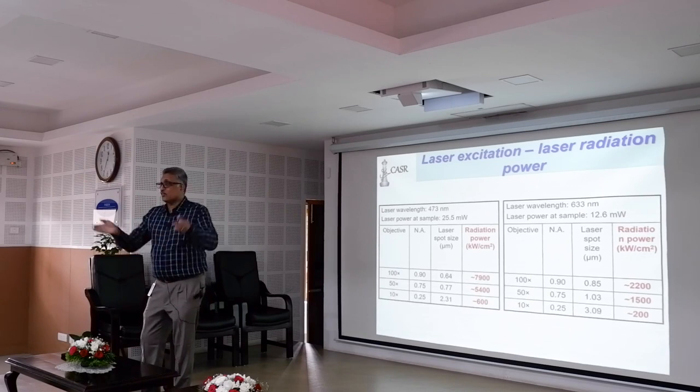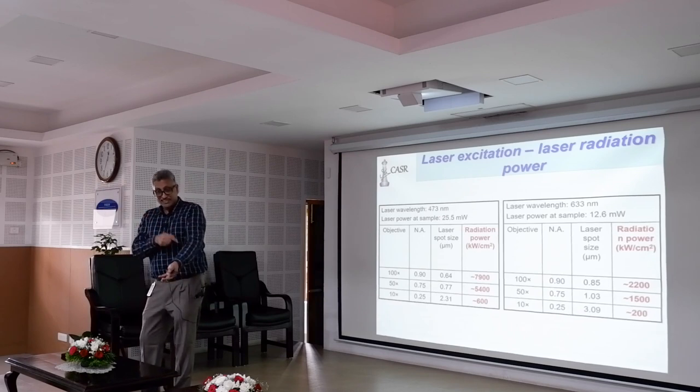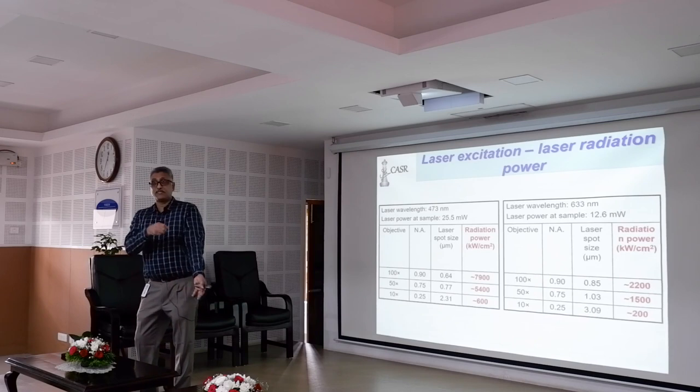To increase the light, you have to focus. But when you focus, you increase the heat if it absorbs. Right? My skin absorbs many of the light rays from the sun, right? Because of your skin color. So it burns my skin, right? That's the reason. Heat is generated whenever absorption happens, right? So absorption should not happen.